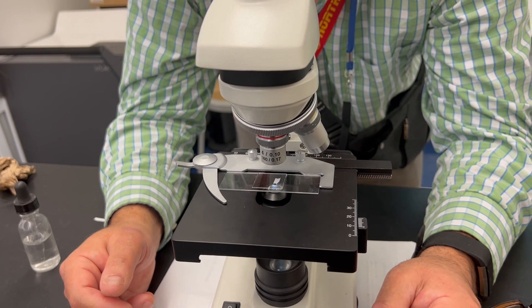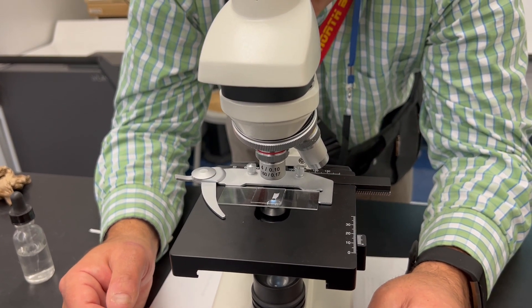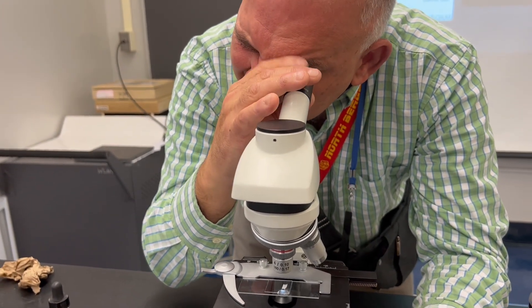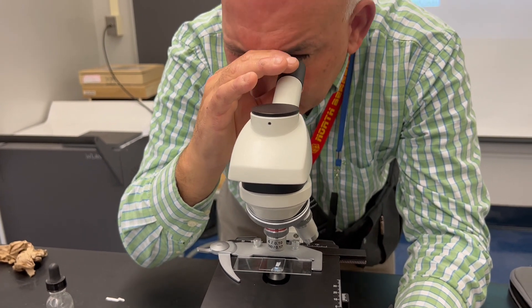I can see it — the E is upside down and backwards, and it's right in the center. My microscope also has something called a pointer. If you move this around, that little black line is a pointer you can use to identify things.